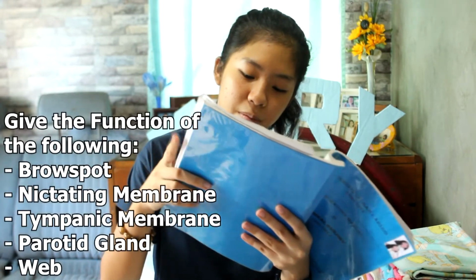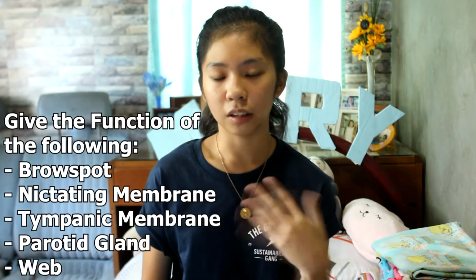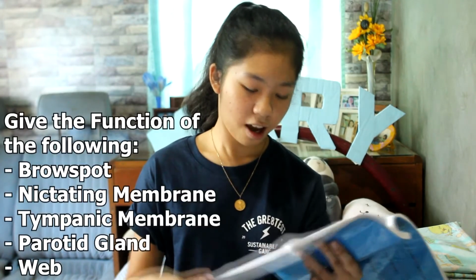Next is the tympanic membrane, the eardrum. The purpose of that is to transmit sound waves to the middle and inner ear, allowing frogs to hear both on land and in water. And then the parotid gland, which is the poison gland, seen only in toads. It produces poison to protect themselves from their enemies or their predators.